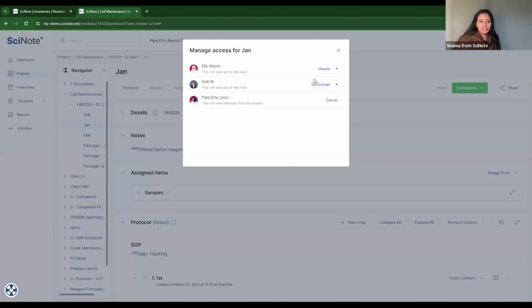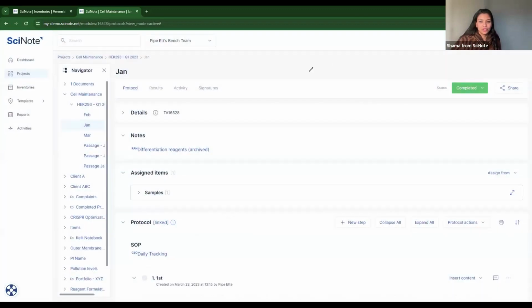Yeah, the gist is just that all the members involved in any capacity need to be a part of the project. And then their roles can be adjusted further down the line. Not everyone needs to have the same role. I think that works really well.